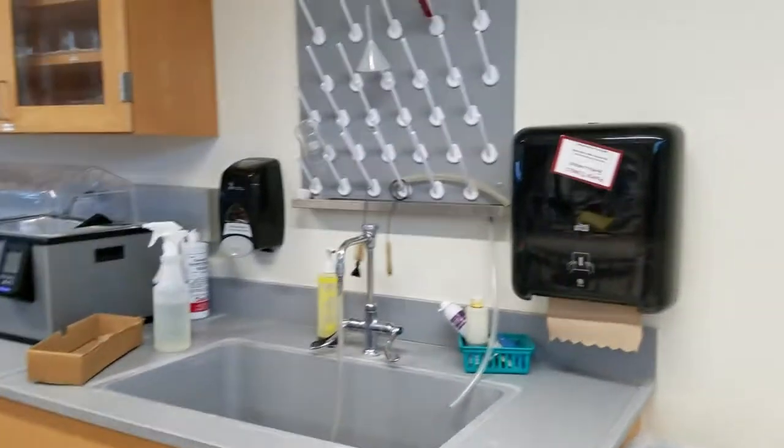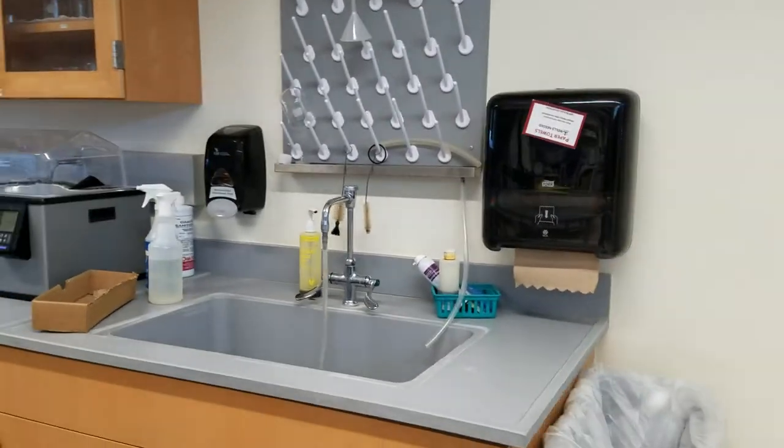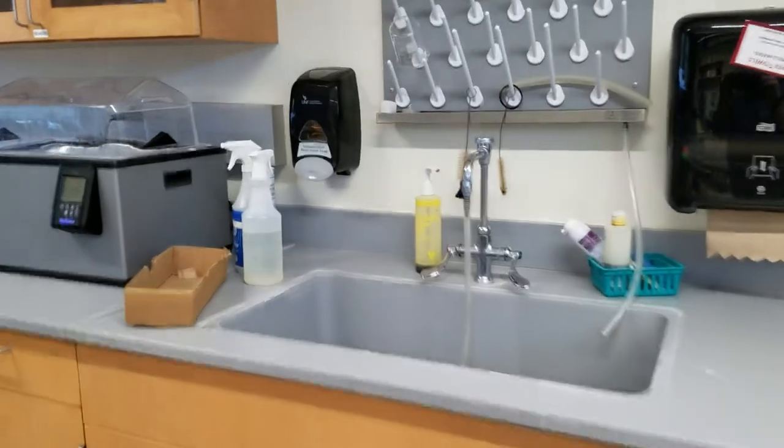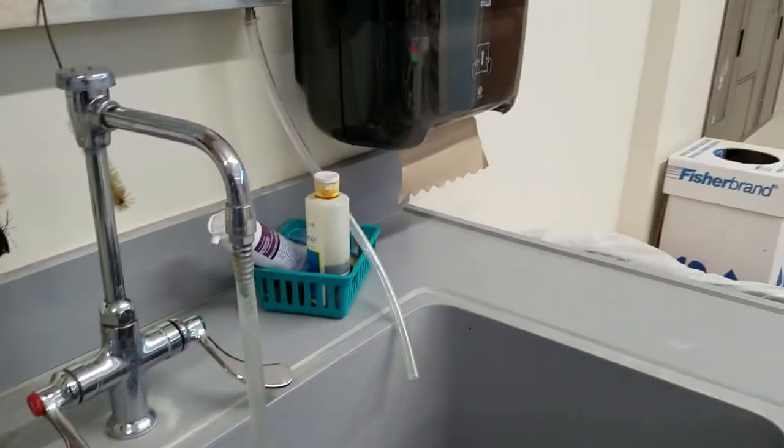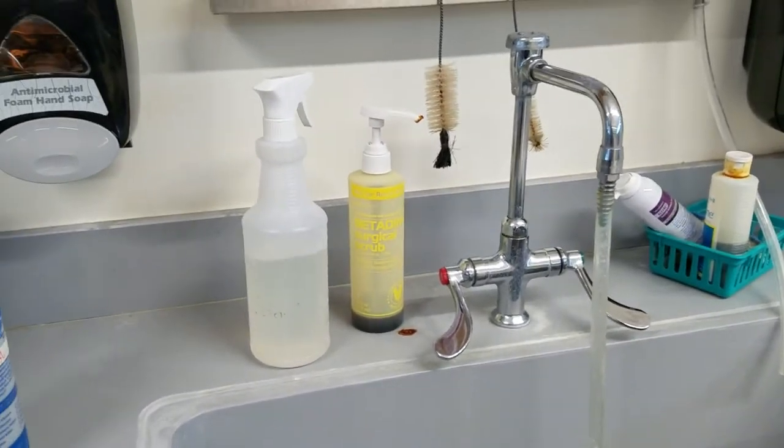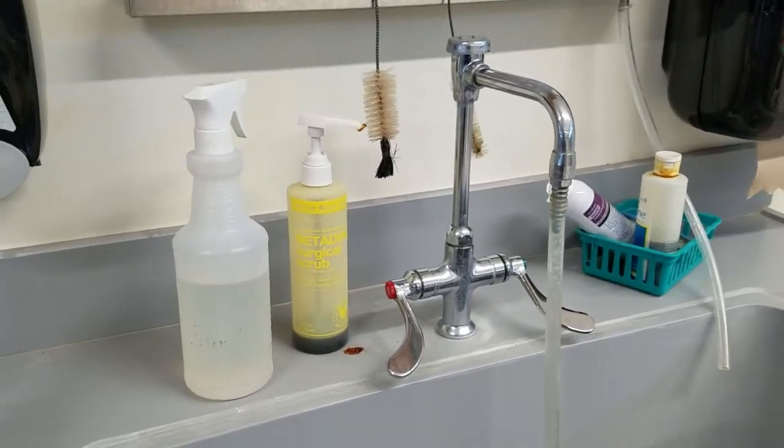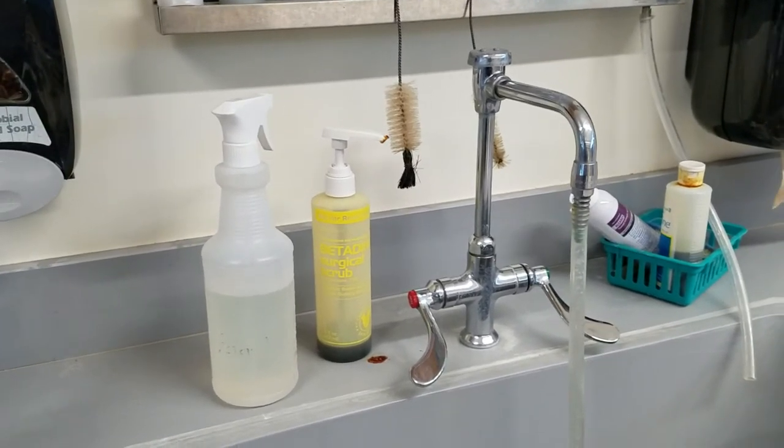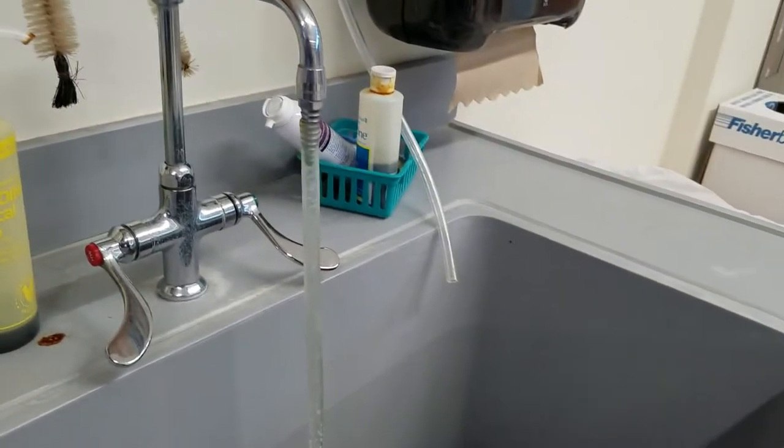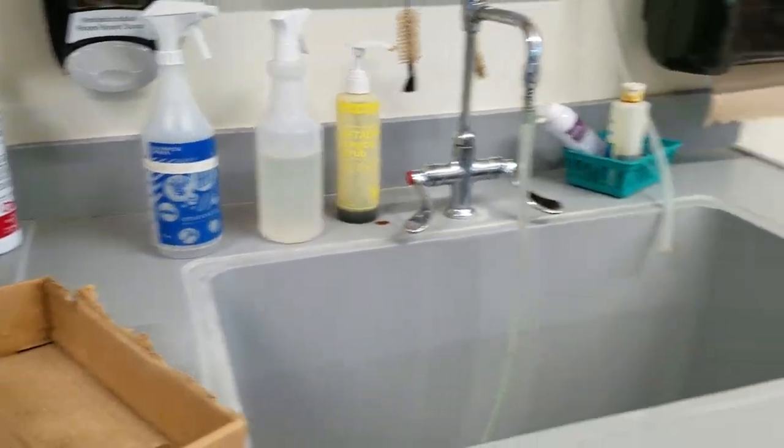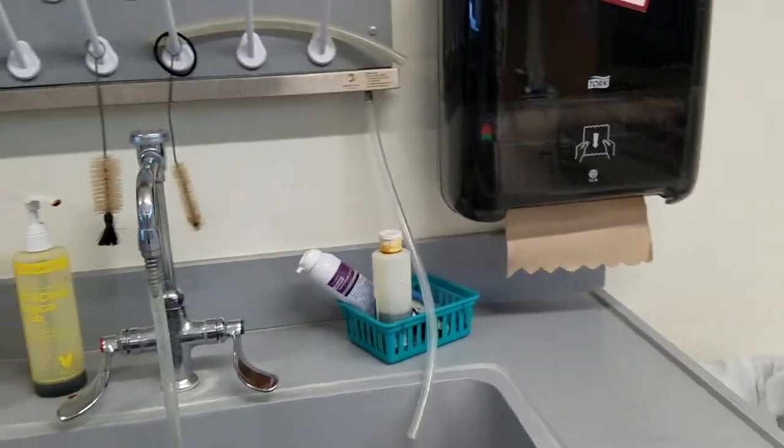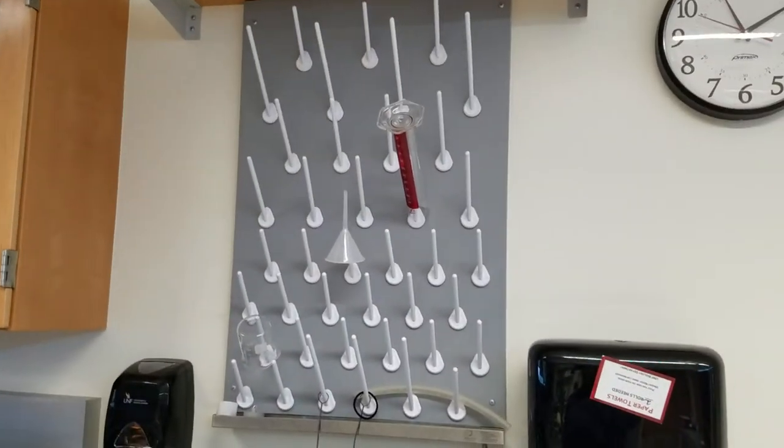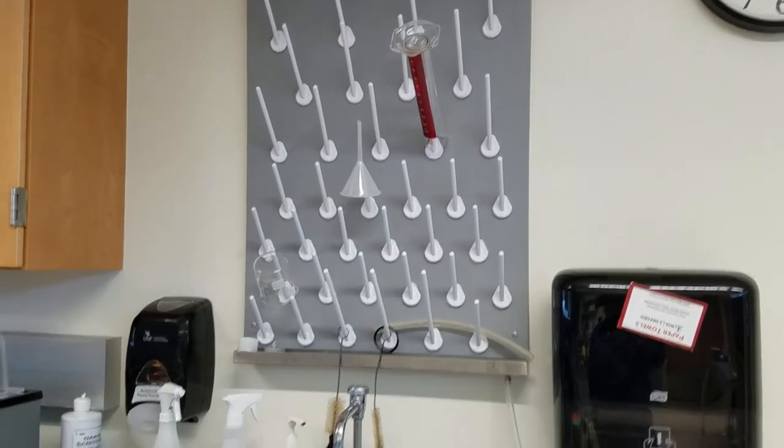On each side of our lab we have sinks. The sinks always contain some betadine surgical scrub to wash your hands with. I usually have a 10% bleach container to decontaminate certain types of glassware once we have ethidium bromide or another such contaminant on them. Students are usually required to wash all the glassware that they use and leave them on the drying rack at the end of the day.